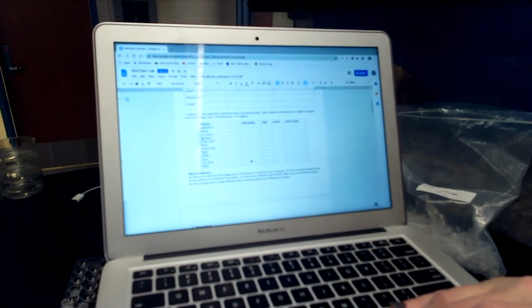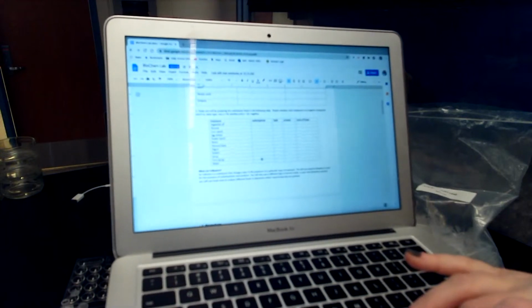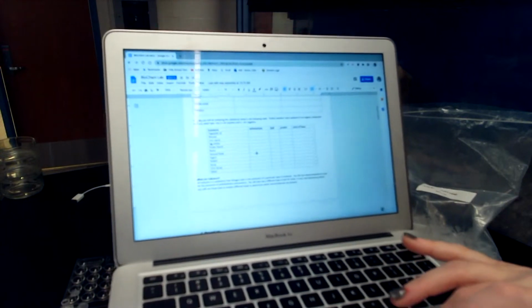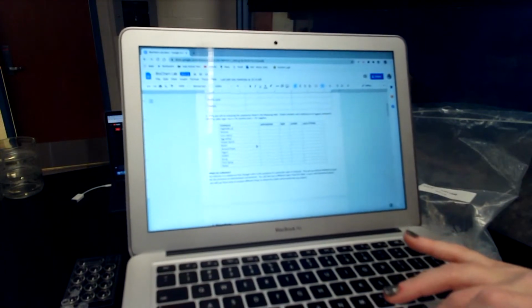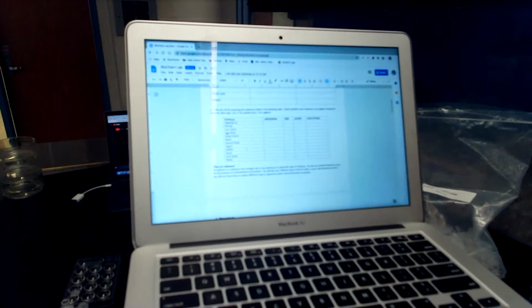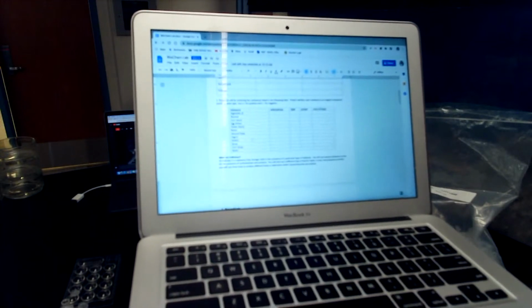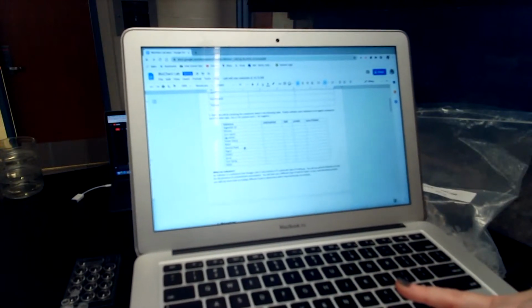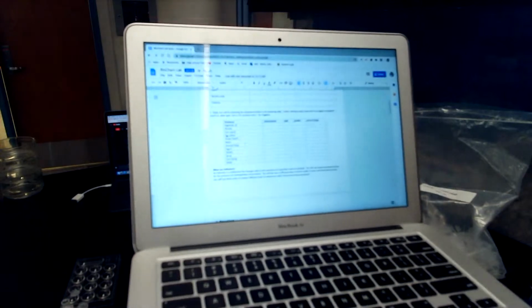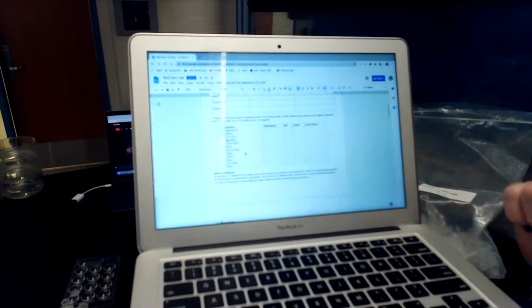Do we want to talk about any of the ones? Do we know what gelatin is? Gelatin is the substance that we put in Jell-O to give it its firmness. So take a guess. And then the almond paste is mostly for cooking. It's a mixture of crushed up almonds and sugar. Good. All right, so I can put this down now, right?